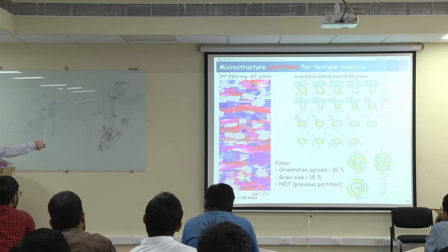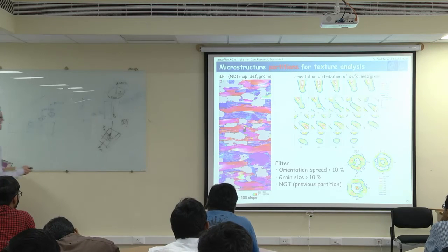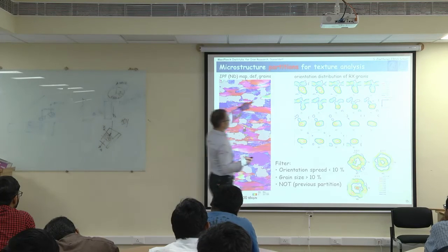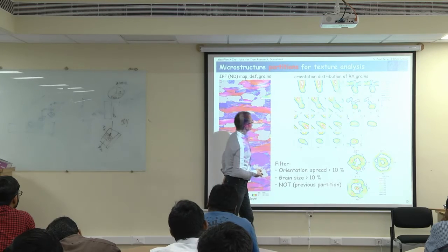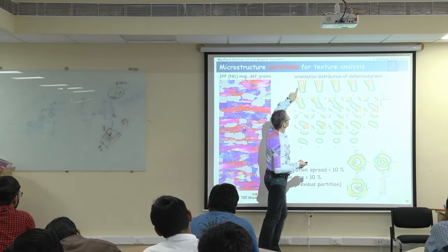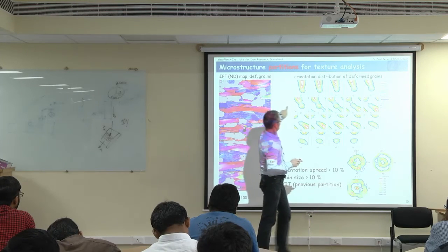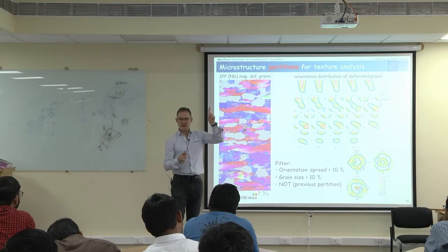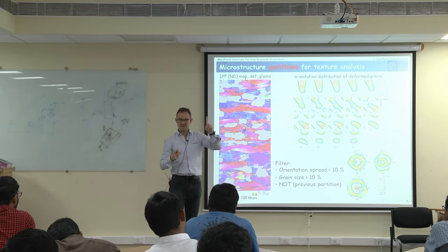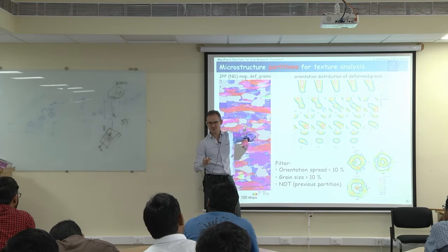And you see the ODF of the recrystallized grains and the deformed grains is really completely different. While in the recrystallized grains you have only this fiber coming up here, in the deformed grains you have mainly this fiber coming up. But not only, this fiber is also there. You see it. And we remember this fiber was 001 parallel to ND, so these are the red grains, and this fiber here is 111 parallel to ND.